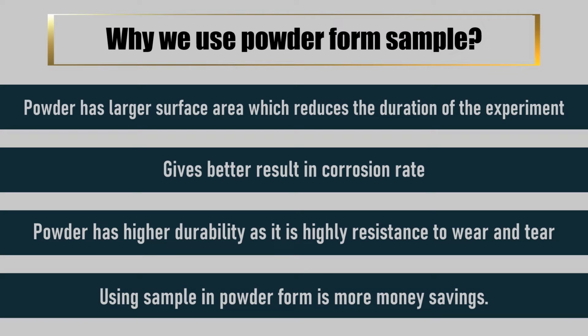Using a sample in powder form is more money saving. This is because less equipment is needed in the process, and hence the overall cost is lowered.